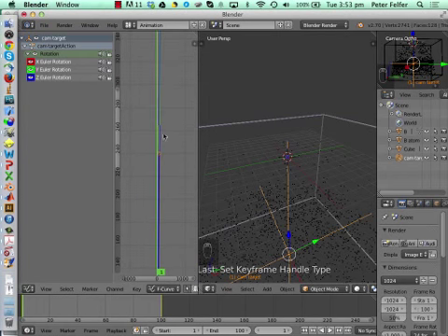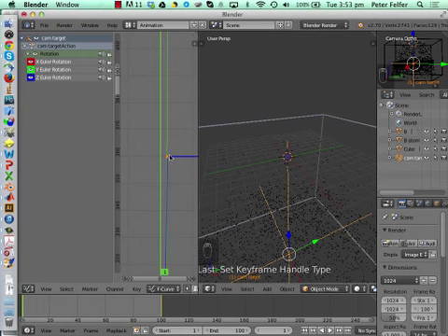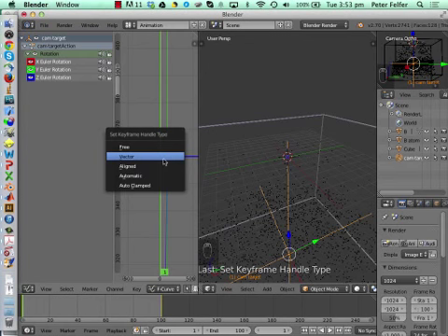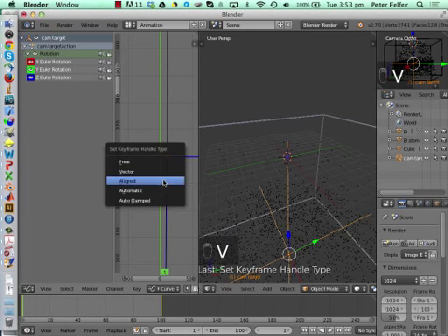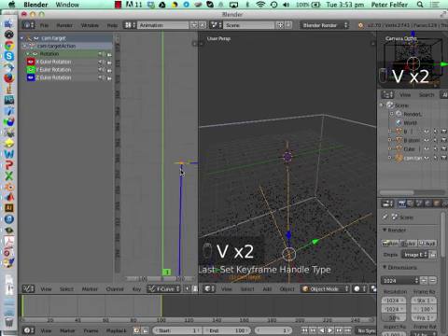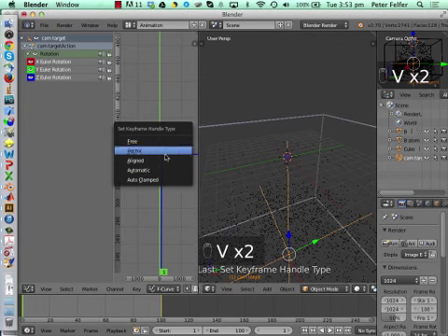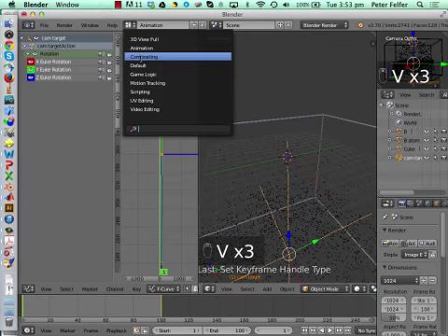So what was a round line... if you go and click to free, all, and go to aligned, it's round. No, automatic, it's round. It's rounded out with the speeding up and slowing down. And if you go to vector, then it's nicely doing the animation.